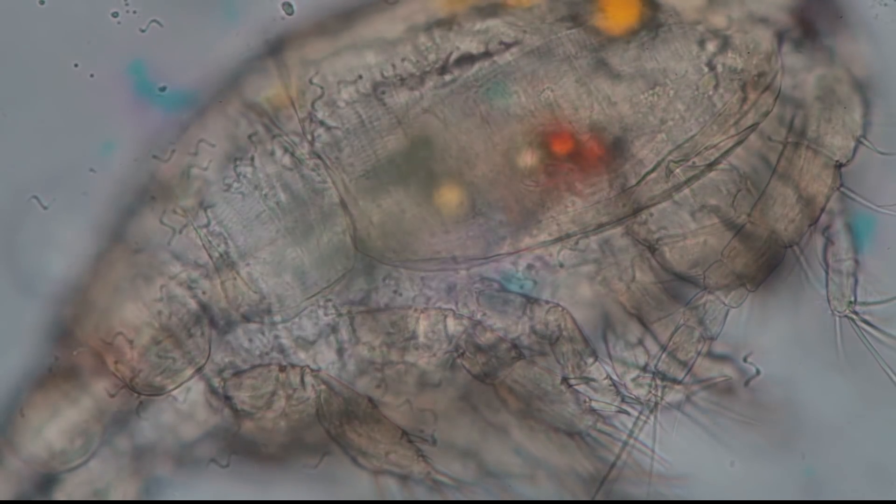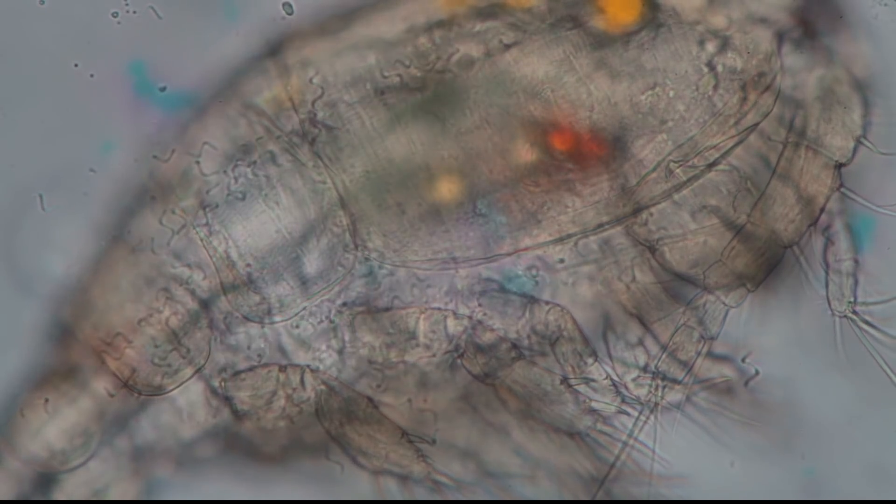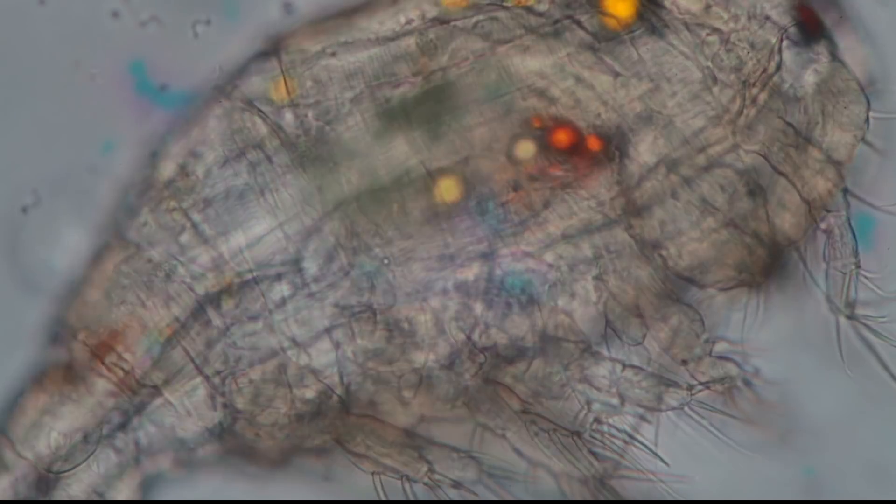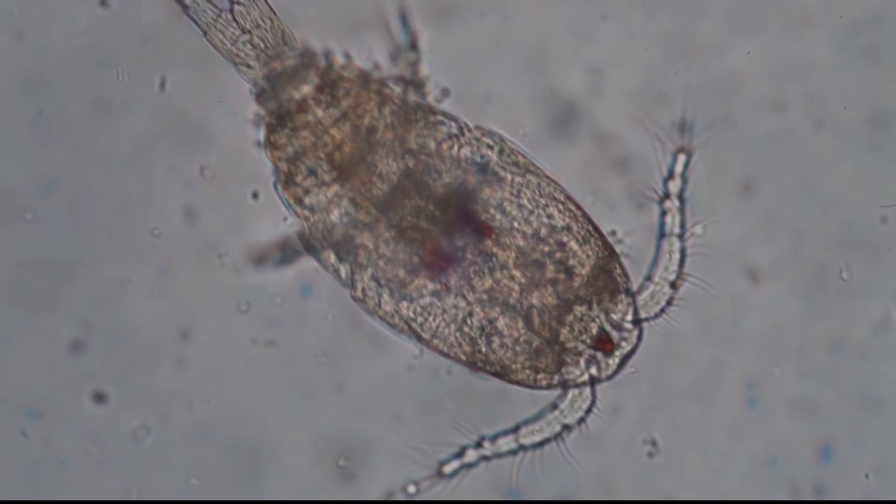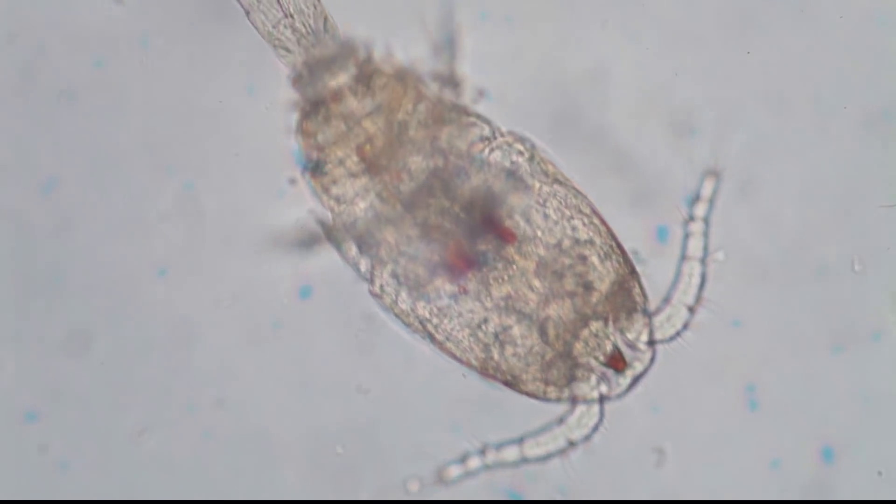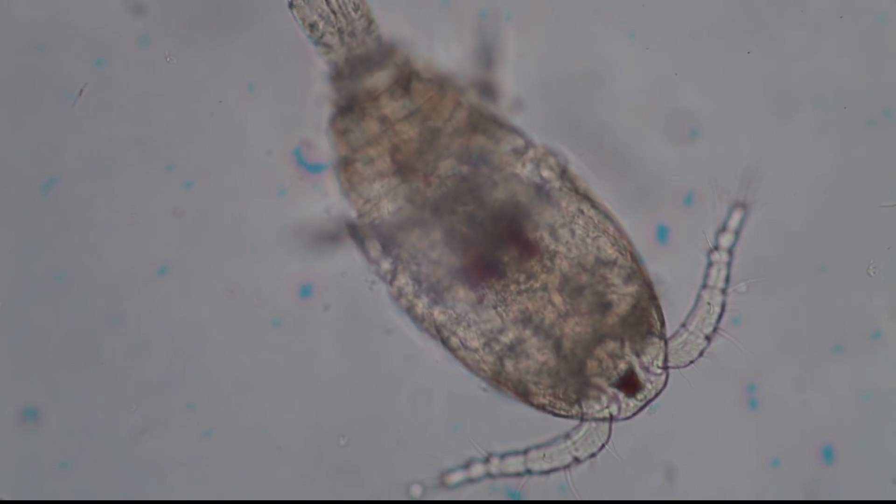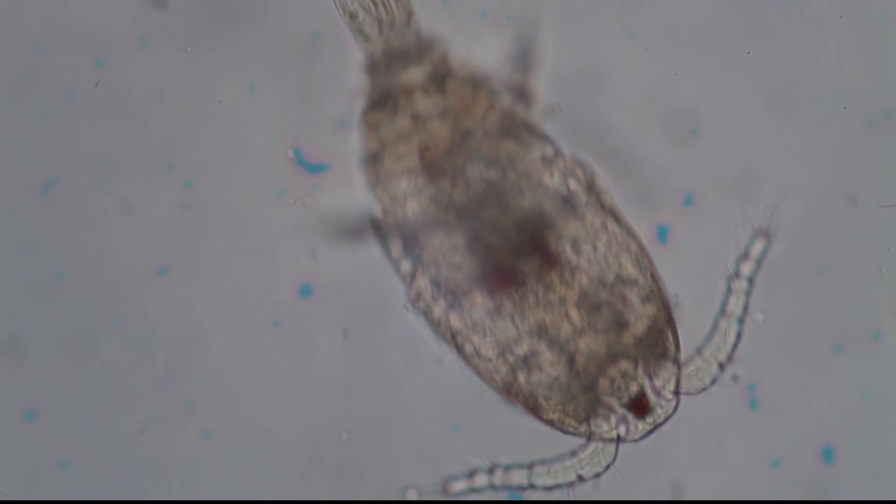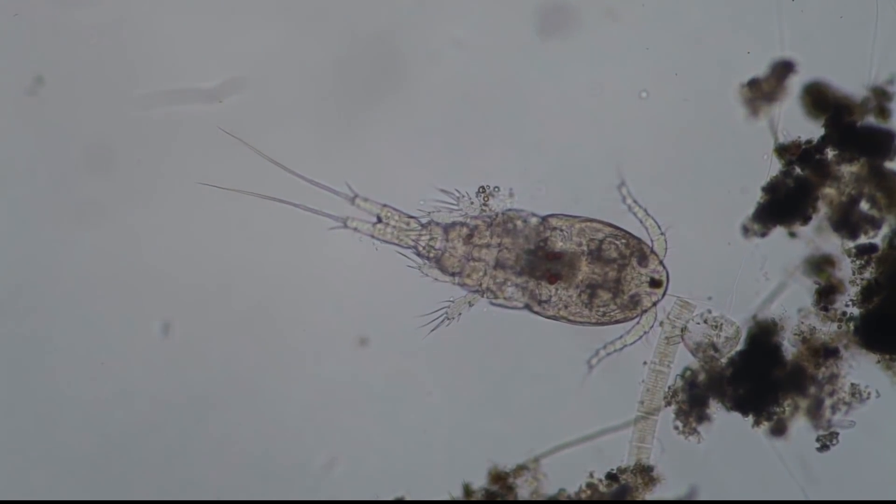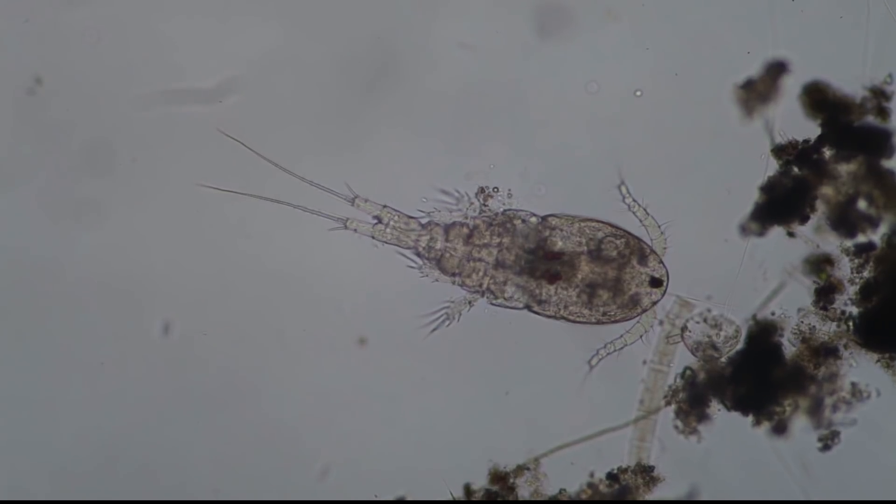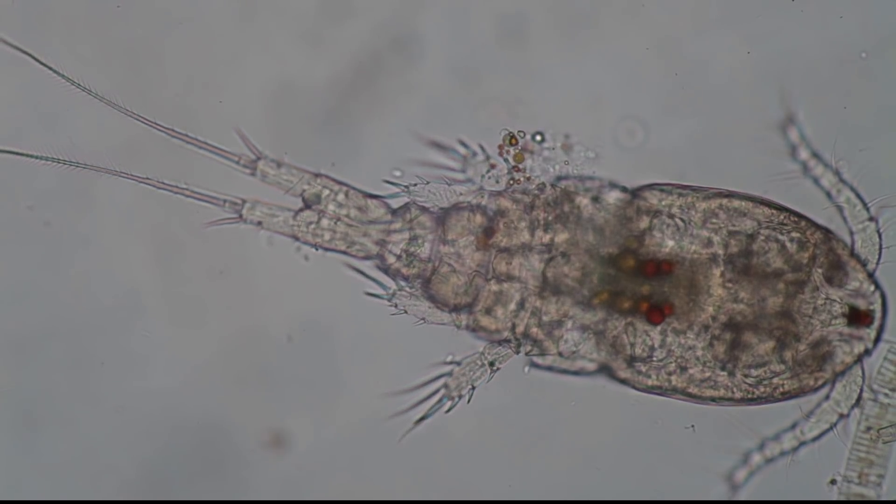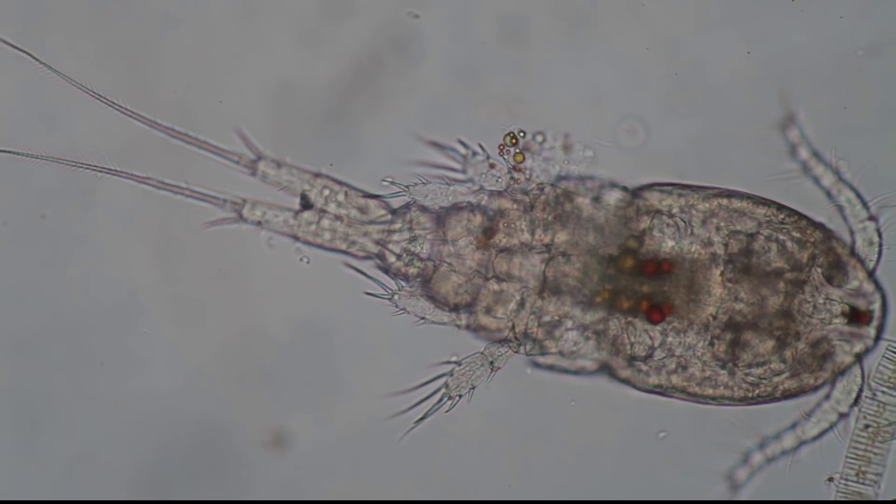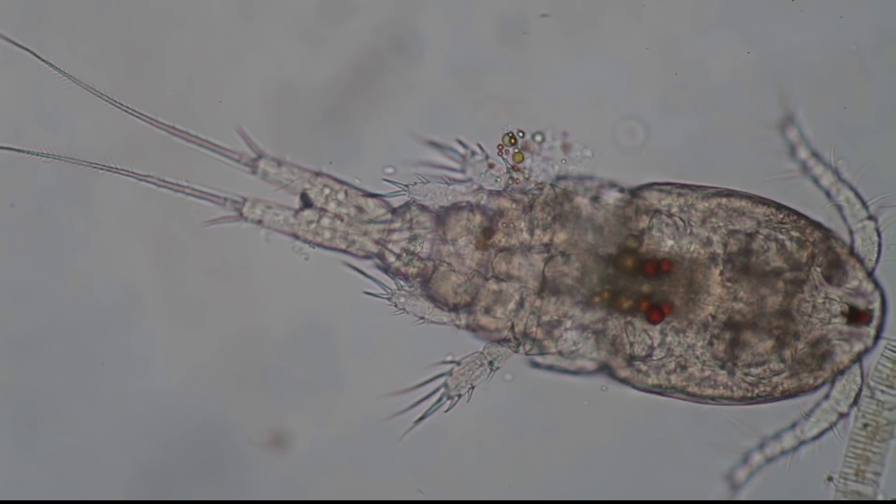I knew that spirilla can be found in fresh water. And I also knew that they are quite large, but actually I did not expect them to actually grow directly on water animals. So this is now the organism which is flipped around now seen from the top. And it's now shaking a little bit because unfortunately I was bumping the table on which the microscope was standing. So basically the shaky movement that you see is now basically me being a little bit careless. And you can already see that this one, the organs are not moving anymore because it started to get already quite ill. And you can also see that there are now still spirilla swirling around. This one has quite a large tail here in the back.